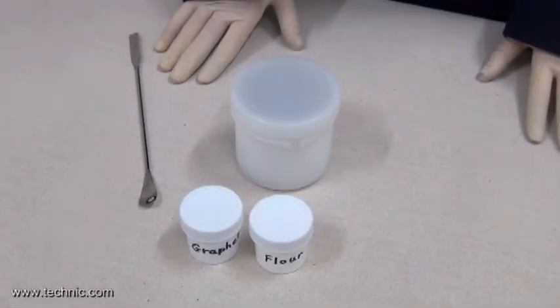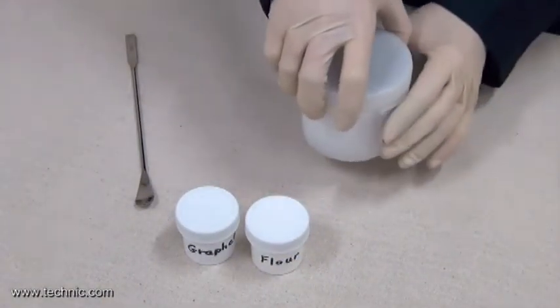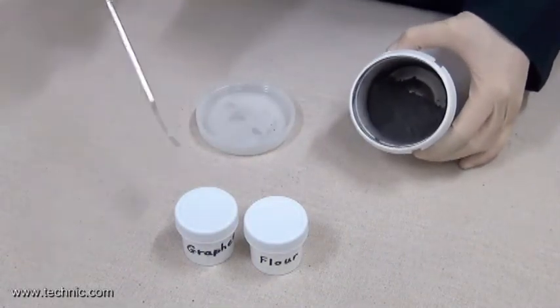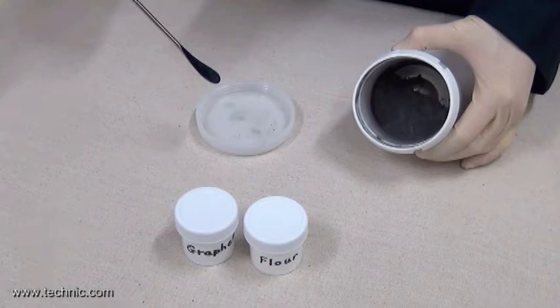Our time is up. Let's see how effective the mixing was. Let's also see if the mixing is thorough.